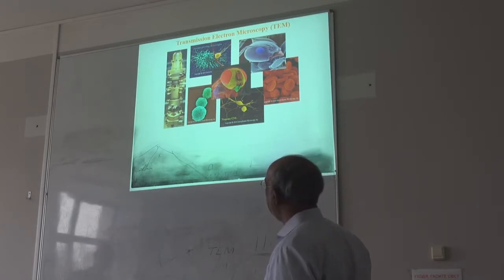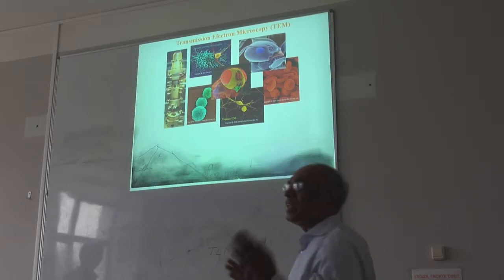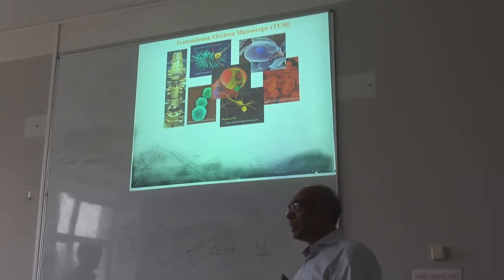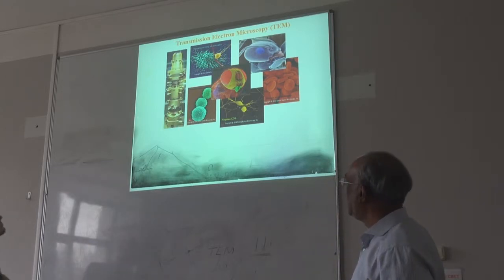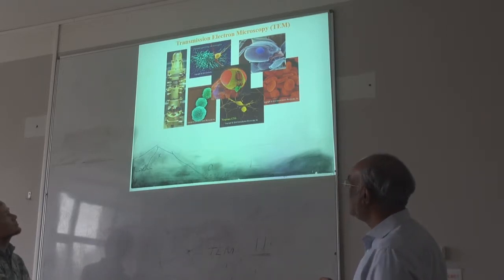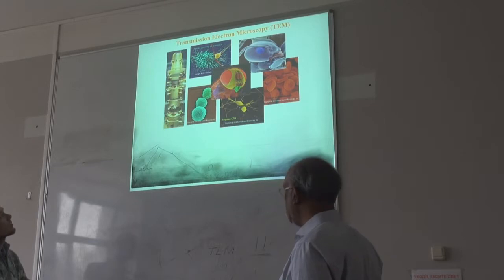Oh really? Okay. Basically what you have is the electron source, the sample, then everything is about lenses, right? To focus, but here lenses are not optical lenses. They are electric fields and magnetic fields. You have magnets and some parallel plates to focus. Then basically you can create the image here. You can either view from here or project onto a screen, using a CCD camera.